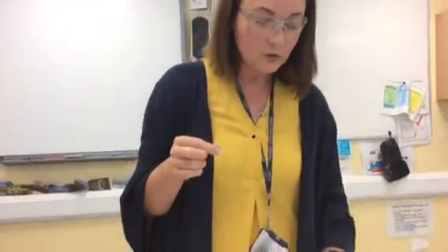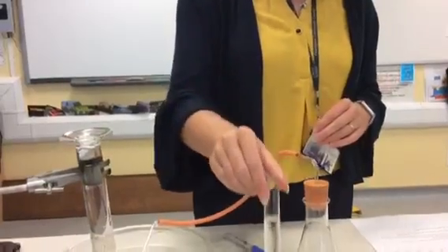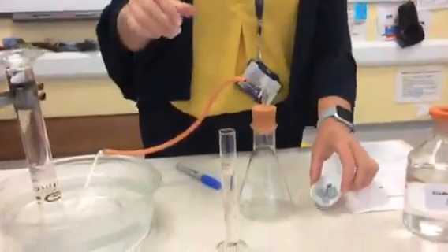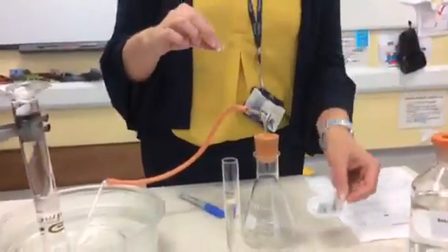So what we've got is sulfuric acid. We've got 25 ml of sulfuric acid in our measuring cylinder. It's 1 molar sulfuric acid. And then we've got approximately 5 pieces of zinc in this container here.